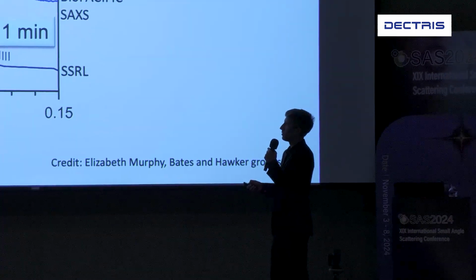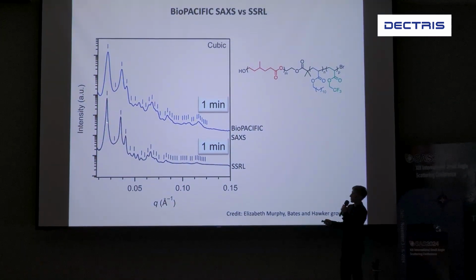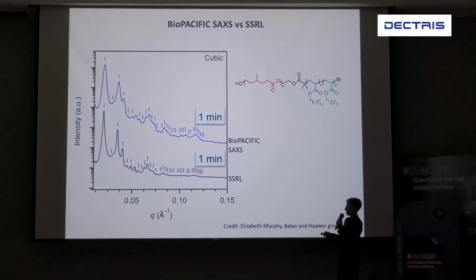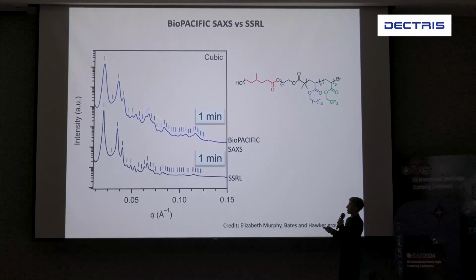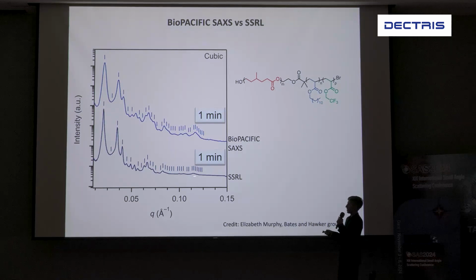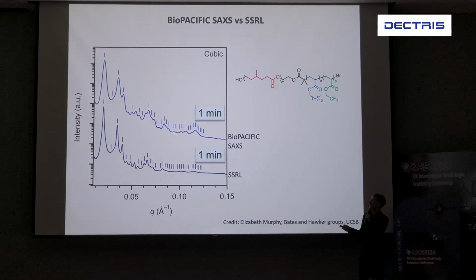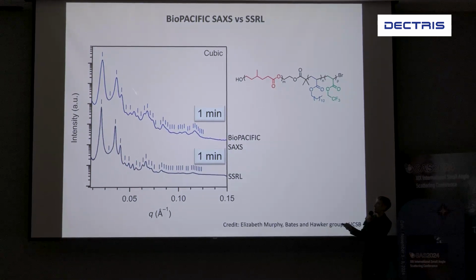Oh yeah, I forgot to qualify that. Unfortunately, in retrospect, we didn't really realize that the peaks are lower here. The sample was taken one month later. I forgot to qualify. You can clearly see that the peaks are sharper here, so the resolution is better at SSRL. It's just that we synthesized it, ran it at BioPacific, and then waited a month, and we thought it would be just as healthy, but it looks like it did degrade a little bit. We're not trying to claim that we're better than a synchrotron in any way. We're just trying to say that you can get comparable data and that the key features in terms of the crystal determination can be seen there.